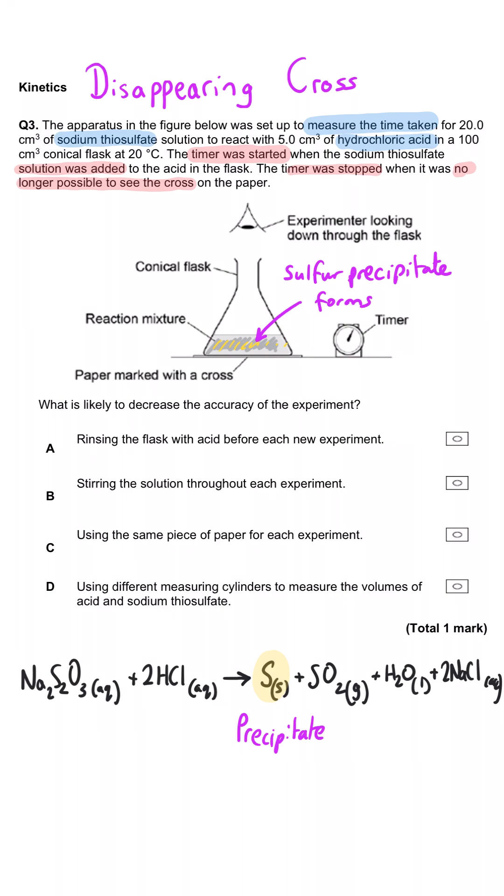Which is likely to decrease the accuracy of the experiment? Rinsing the flask with acid before each new experiment.